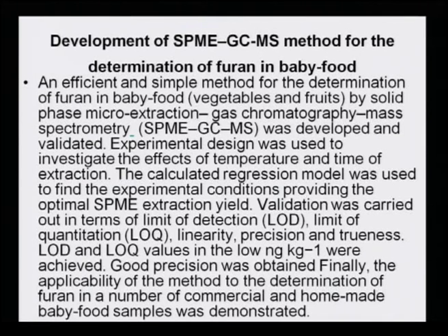Validation was carried out in terms of limit of detection, limit of quantitation, linearity, precision and trueness, and it speaks for itself that levels as low as nanogram per kilogram could be detected. So, we know that good precision was obtained. Finally, the application of this method was ideal for determining furan in baby food.